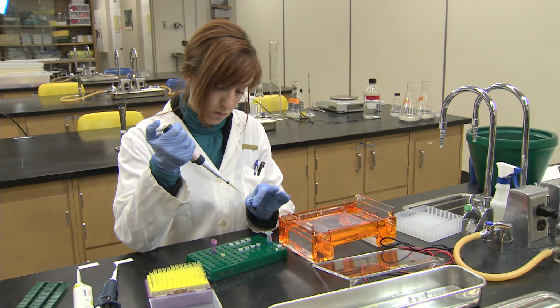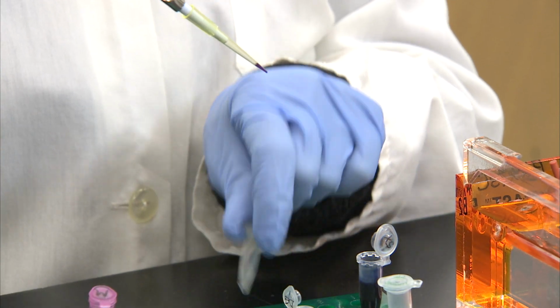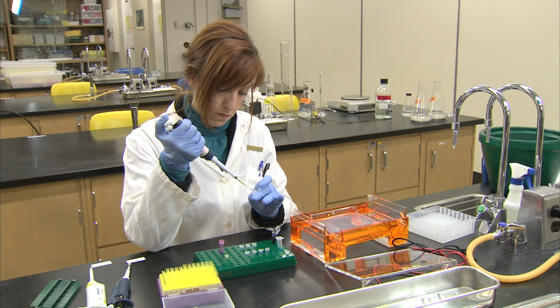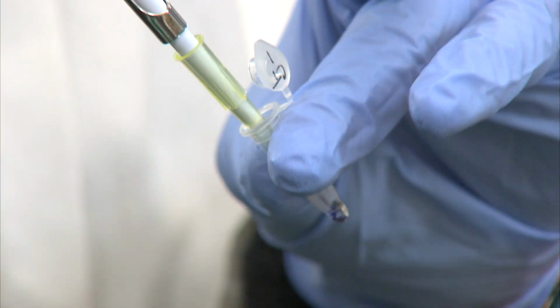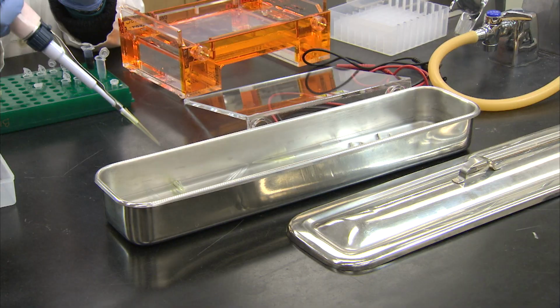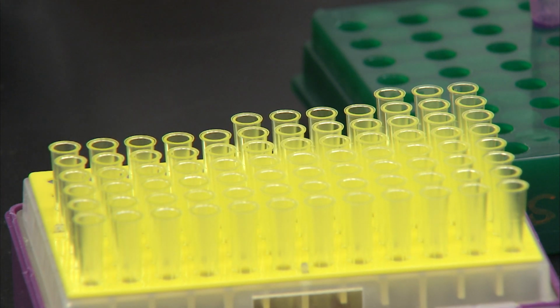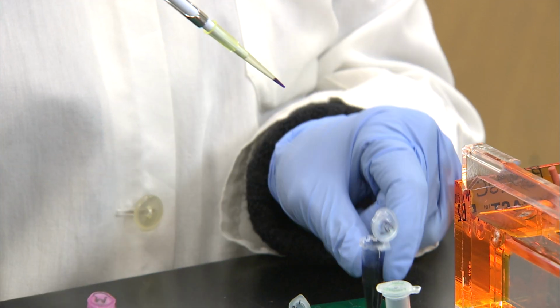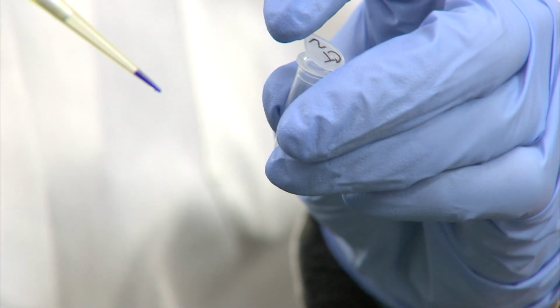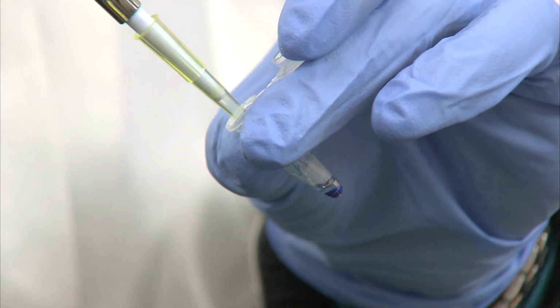To get the DNA samples ready, they must have loading dye added to them. This will supply a tracking dye or combination of dyes, such as orange G, bromophenol blue, or xylene cyanol. Additionally, the loading dye will increase the sample density using glycerol so that it will sink into the wells. The dye can be mixed with the samples by gently pipetting up and down a few times.